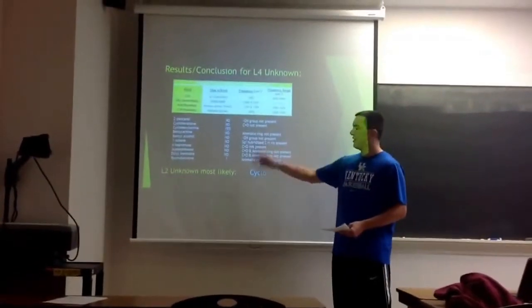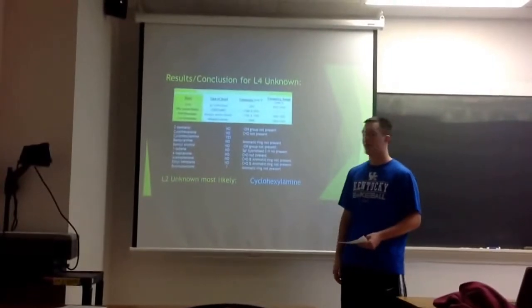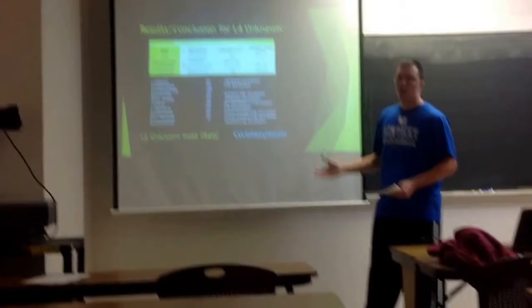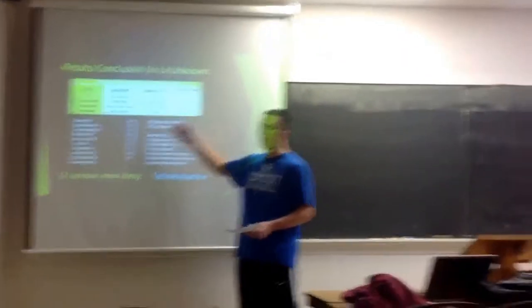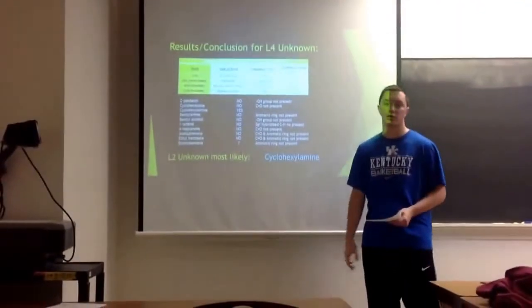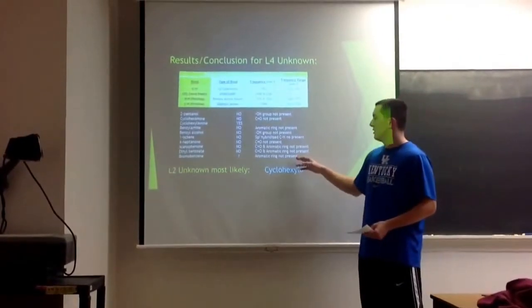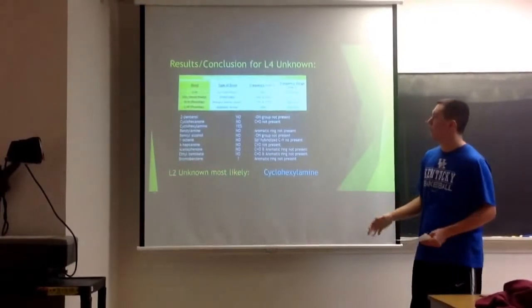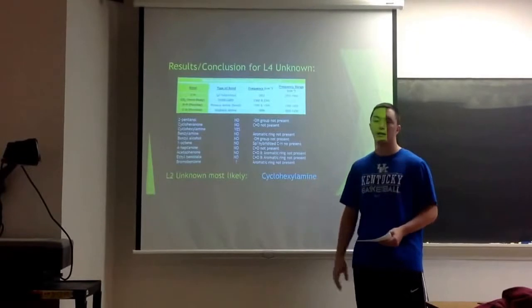I narrowed it down to 2 on this one. It's either the cyclohexylamine or the bromobenzene. Since I thought that those other peaks could be NH bonds, I think the spectrum would match up better with cyclohexylamine. That's why I looked at the fingerprint region to try to deduce what it could be. The bromobenzene should have an aromatic ring, and I don't really think an aromatic ring is present in this one. So my conclusion would be that it's cyclohexylamine.